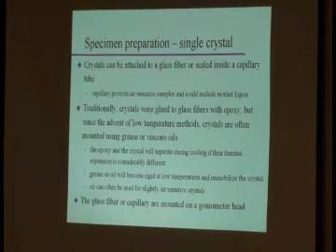So what you use instead is some kind of a grease or oil, okay? Because grease or oil at room temperature may leave the chance of the crystal falling off over time. But once you go to low temperature, what happens to grease? It gets pretty solid, right? We probably all know that from our kitchens. Cold grease solidifies usually. The same happens here. So you basically freeze the grease. The crystal is perfectly mounted. It's easy to take off after you're done with your experiment, okay?